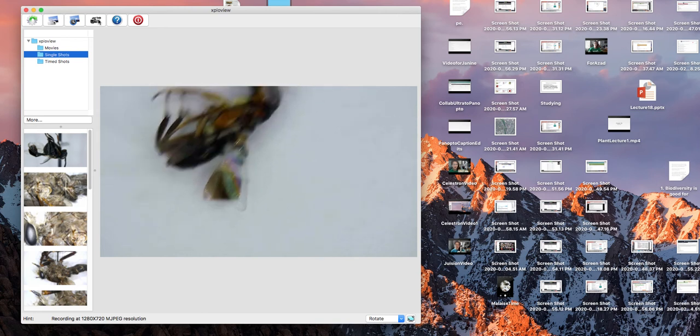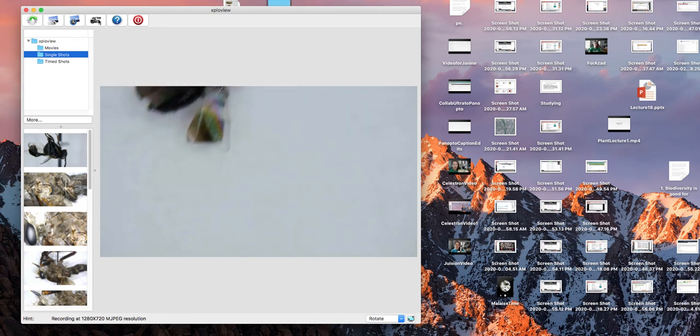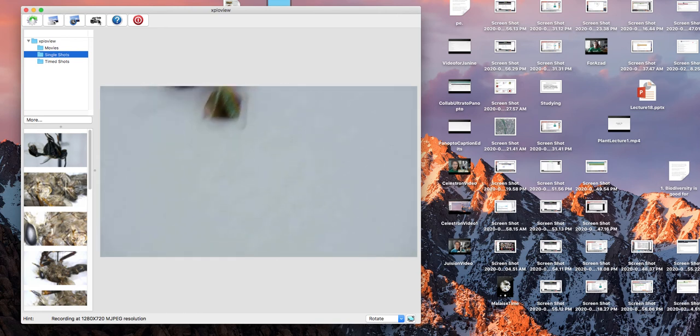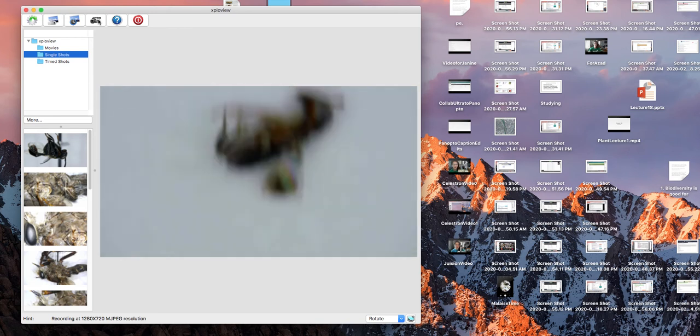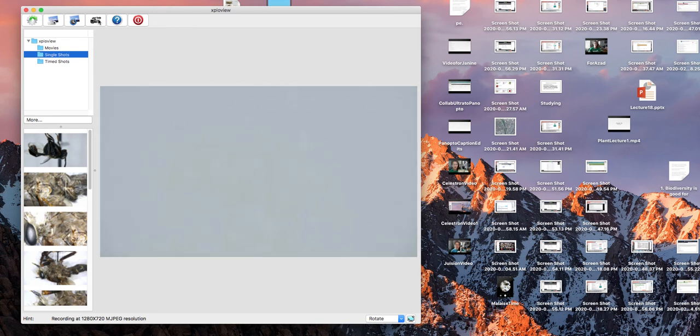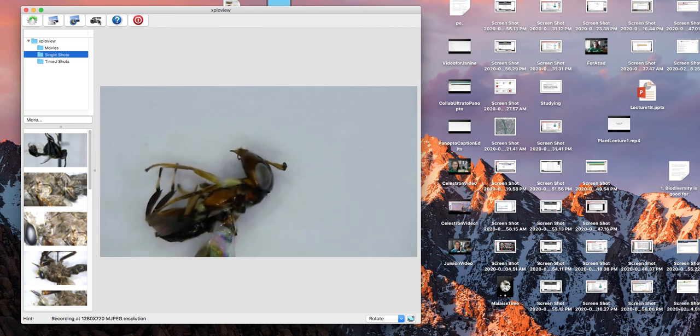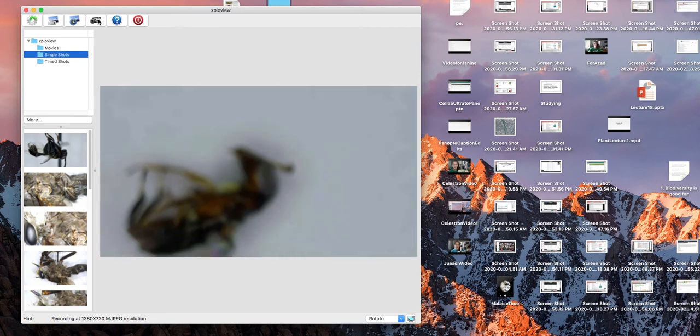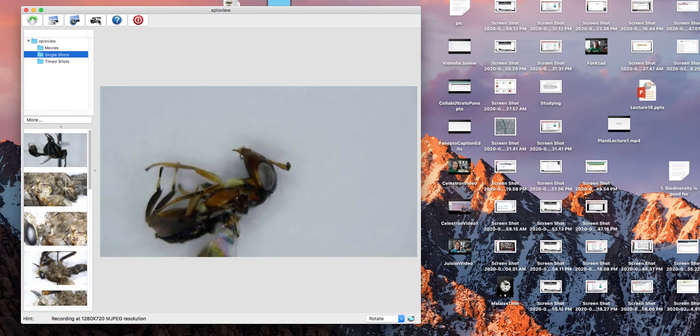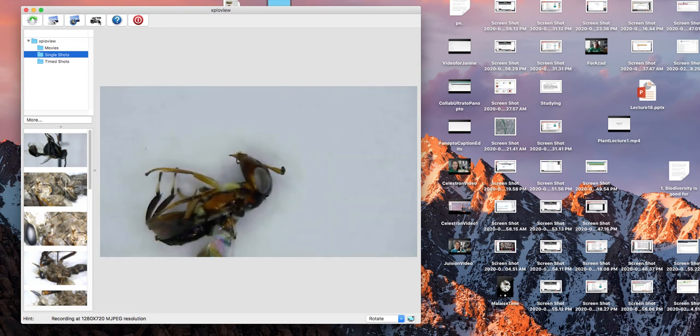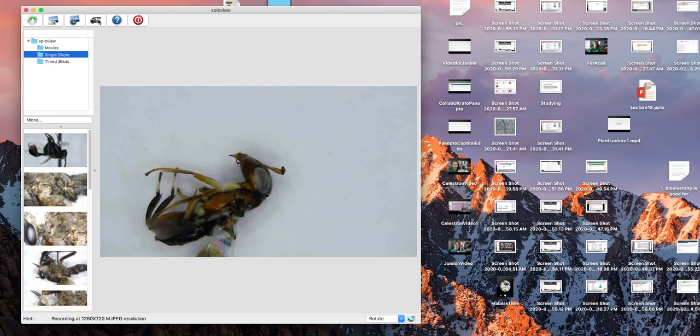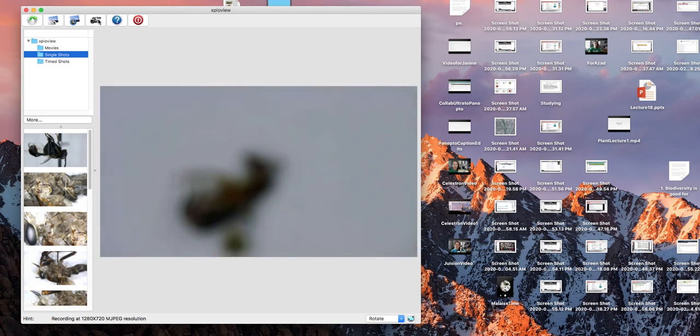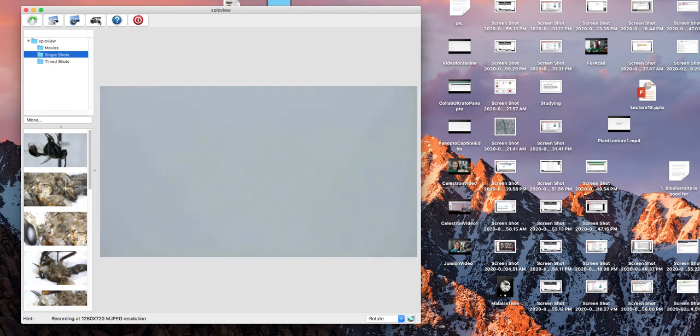But let's see while we have this here, if we can get this into somewhat better focus. Get this a little bit closer to the screen. So we could focus this a little bit more. I'm all the way at the bottom right now. I can't get any closer. And for an insect that's only maybe two millimeters, maybe two and a half millimeters, this is pretty good. Maybe you have some students that want to do some identification before they point mount something. This would probably be good for that. Unfortunately, I'm going to have to fix this poor insect later. Let's put this aside. Let's go ahead and go with our big insect.